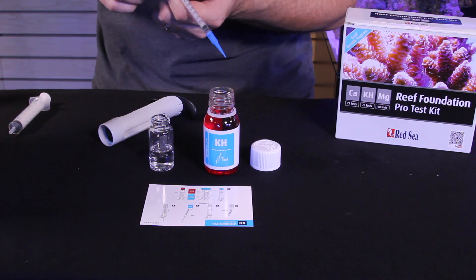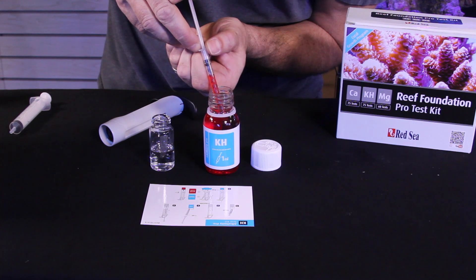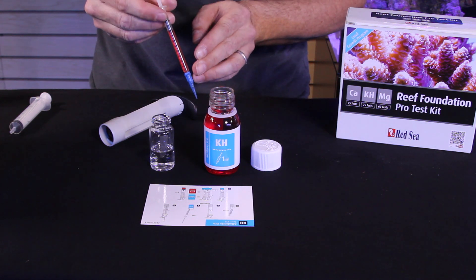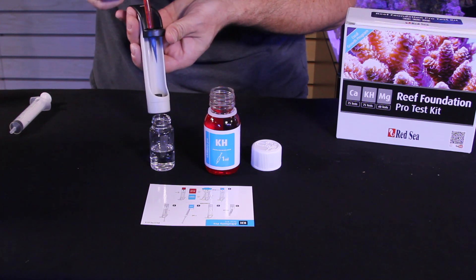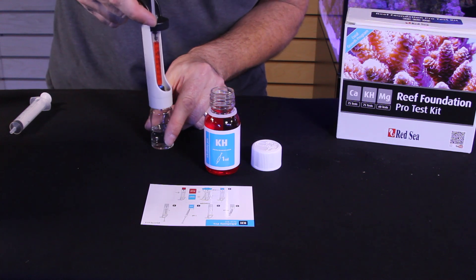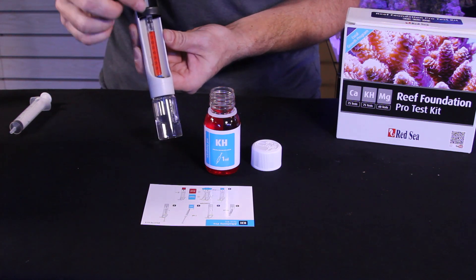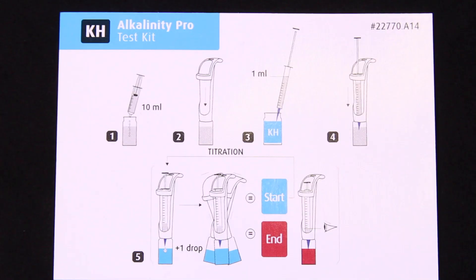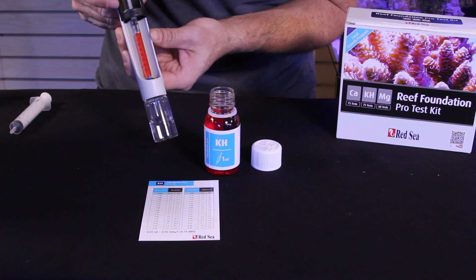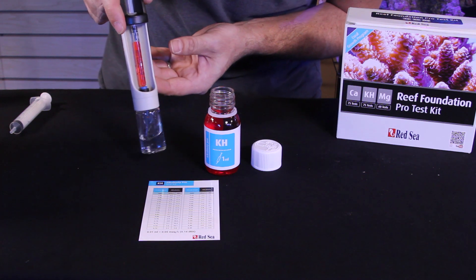Now we're going to do the alkalinity test for our Reefer 170. We'll start by drawing 1 ml of reagent into our syringe, bringing the stopper right to the 1 ml mark. The liquid will not come all the way to the top, but that's compensated for by liquid in the tip. Make sure the tip of the syringe is on firmly to get an accurate reading. Drop your syringe into the holder and thread on your test vial — already filled with 10 ml of sample water. We'll slowly add reagent until we get a color change from blue to red.